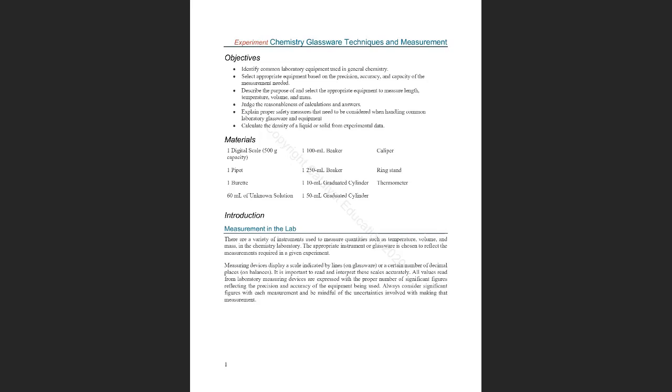The main objective is to identify common laboratory equipment, to be familiar, because you're not going to be doing the experiment. It's going to be a virtual experiment, but at least to learn what pieces, the most common, not obviously all of them, but the basic laboratory glassware and simple equipment. So be familiar with that.